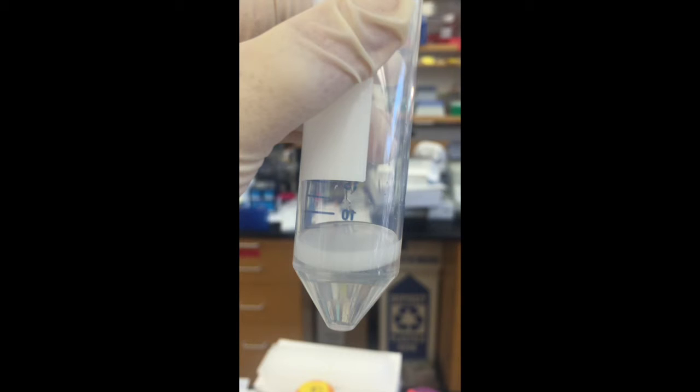What this does is it allows you to watch the wall of droplets run back down the side of the falcon tube and it's really the best check for uniformity of droplet size.